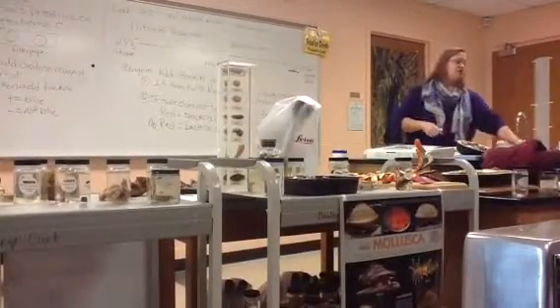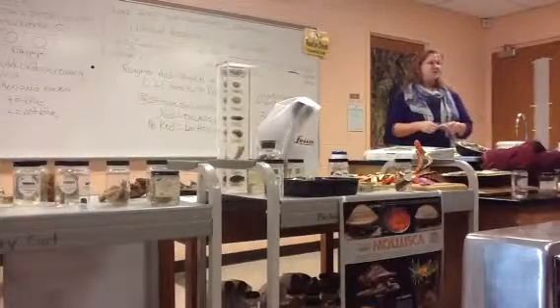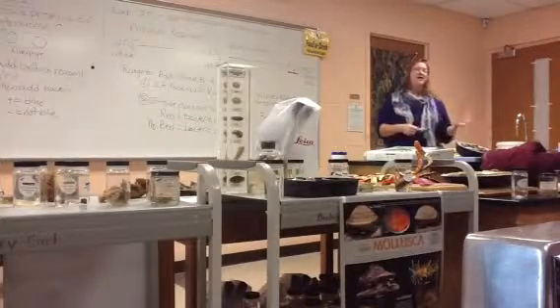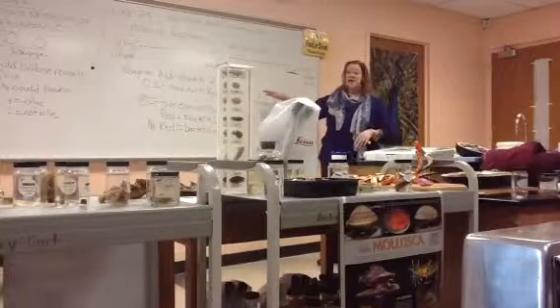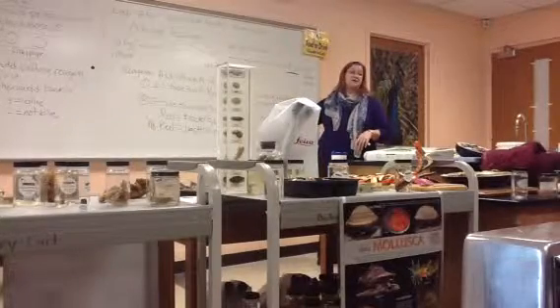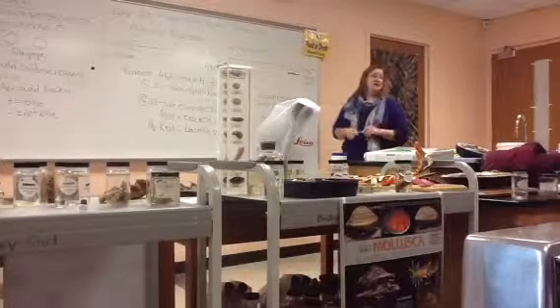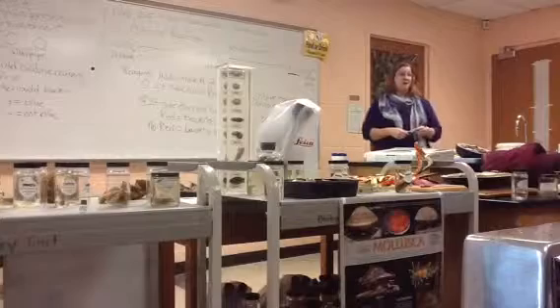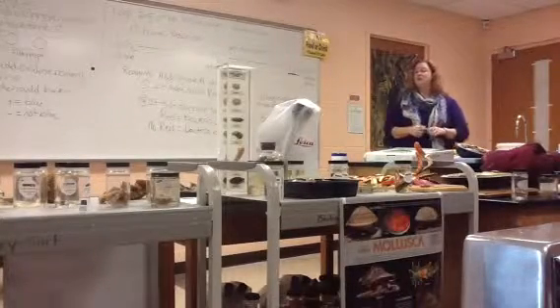The rest of them, it's from the stock cultures and Petri dishes that are listed in Lab 25. So you put them in the incubator, that's all you do today. When we come back on Monday, then we have to add reagents to find our positive from negative. So we've got a two-step process here. Every tube, we're going to add nitrate A and nitrate B. It's another two-part reagent like your VPA and VPB. Okay, so every single tube gets both chemicals, nitrate A and nitrate B.